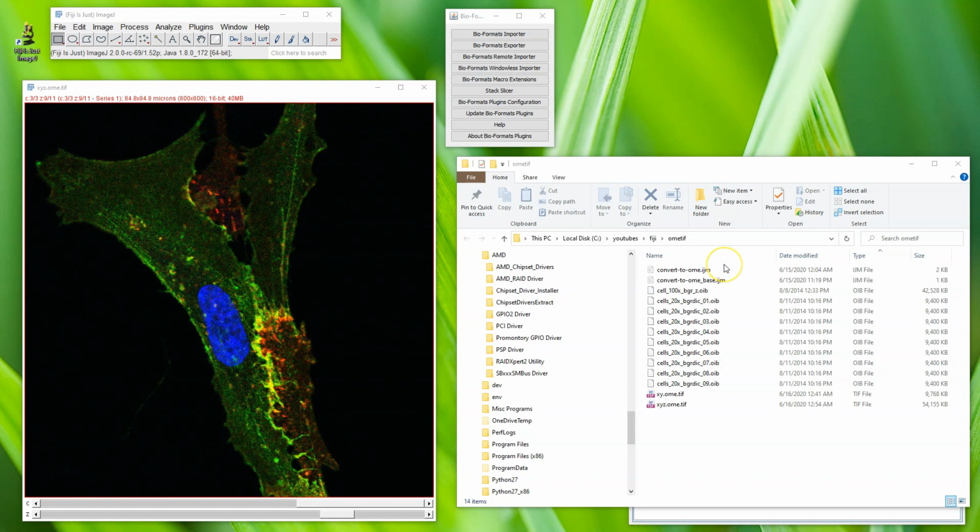Okay, so this is part 3. In parts 1 and 2 we opened a file, looked at an error, looked at the metadata in part 2 and a couple of other things, but we don't want to do any of that. We want to know exactly what we want to do, and then we want to provide a folder and get it to automatically generate the ome.tifs we need from there.